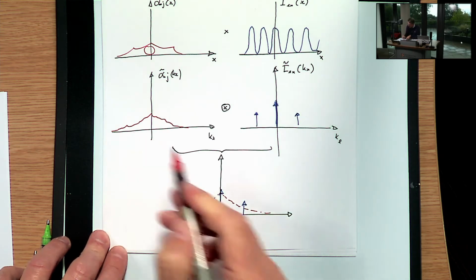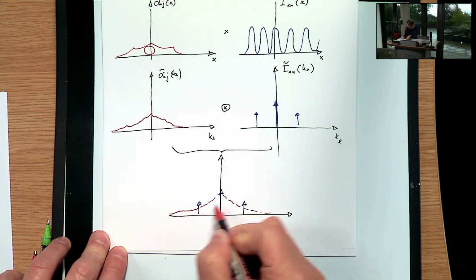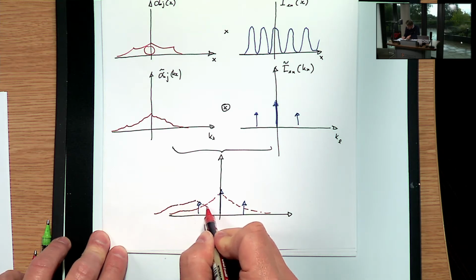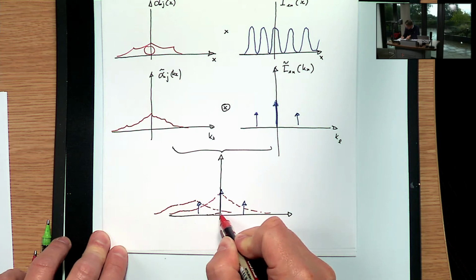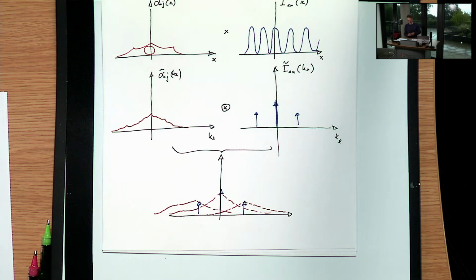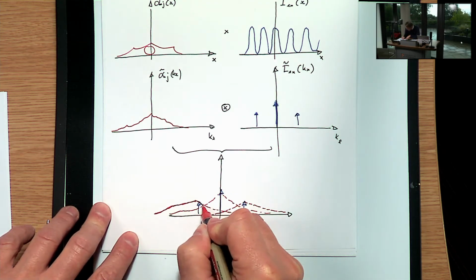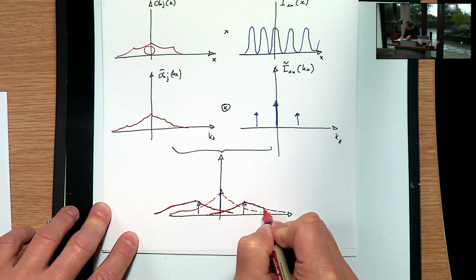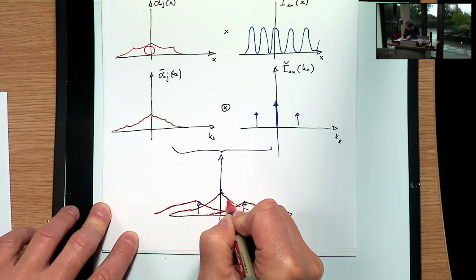Okay, and then you get a copy which is scaled, so that sits here. It's a bit smaller in intensity, but otherwise it's the same. And then you get another shifted version of the spectrum sitting here. So that looks pretty messy, right? And it is. You saw the patterns from the shirt. These beat patterns don't look really like the underlying shirt itself, right?